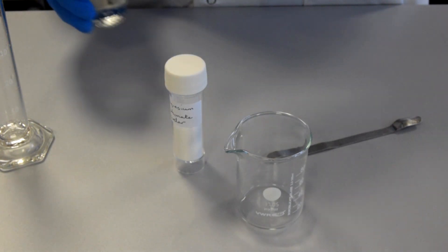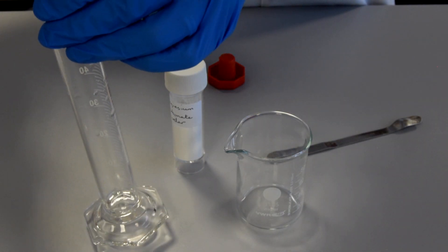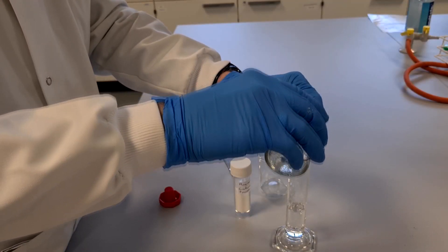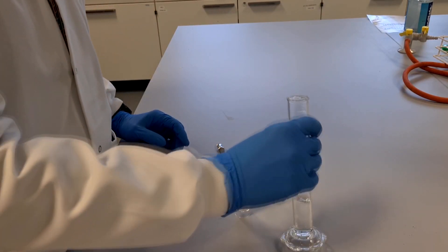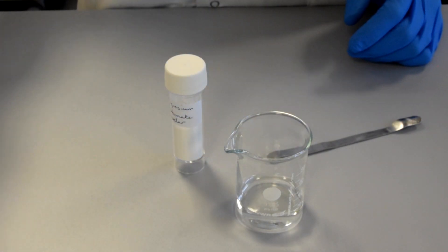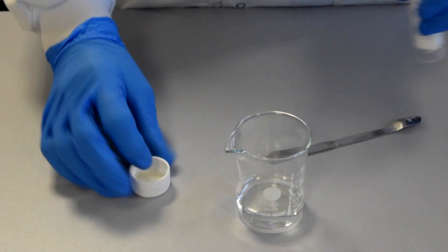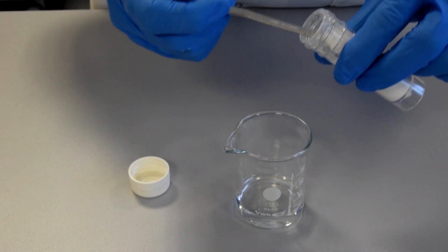I'm going to start by putting 20cm³ of sulphuric acid into the beaker, and then I'm going to add the magnesium carbonate one spatula at a time, and just stir after every addition of magnesium carbonate, until we no longer get a reaction.